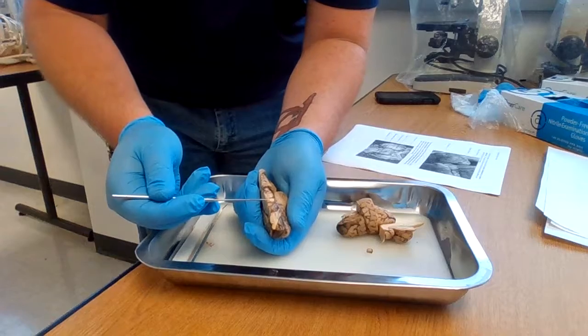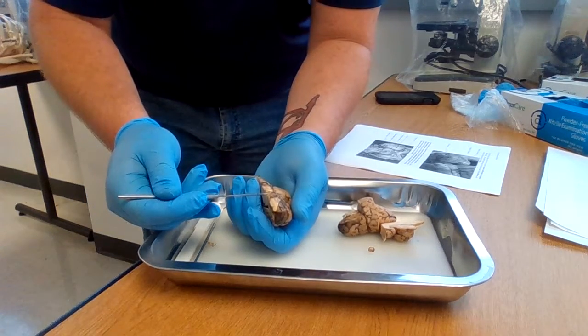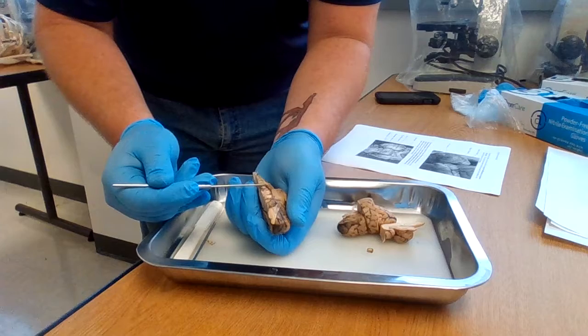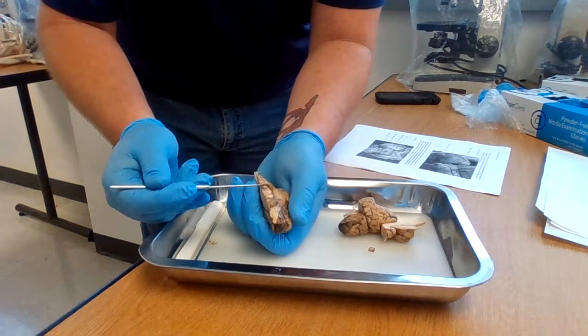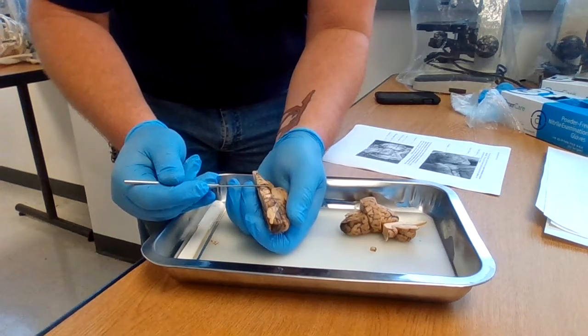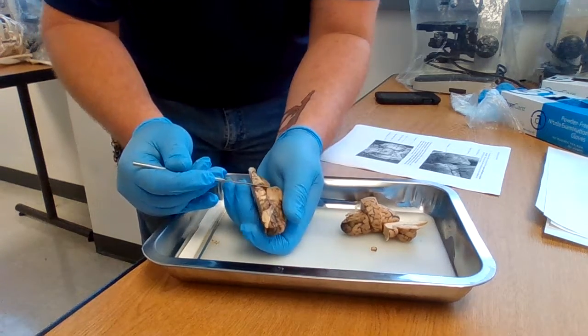Flip it around again. We're going to have the optic nerve, uncus, the mammillary bodies, hippocampal gyrus, then a rhinal fissure.